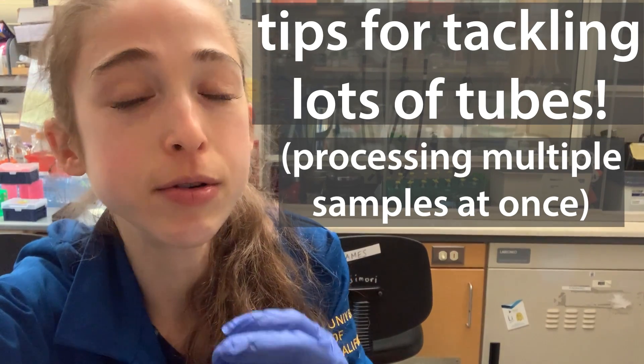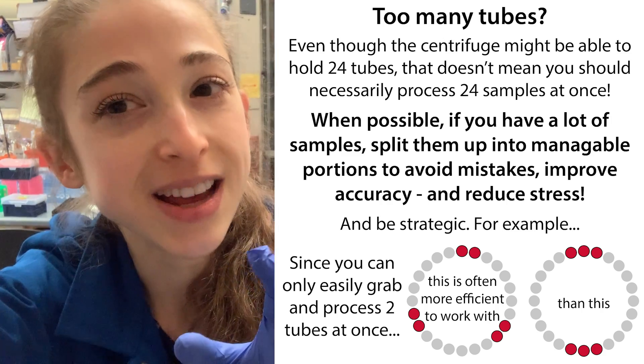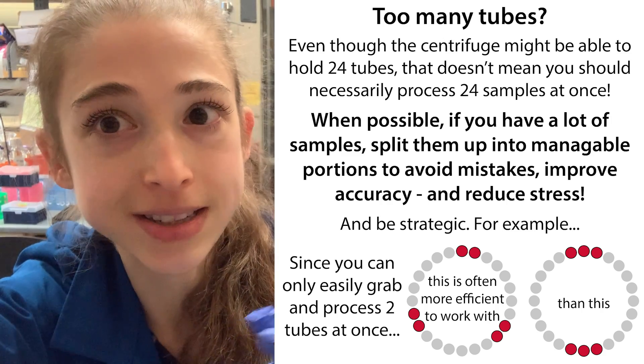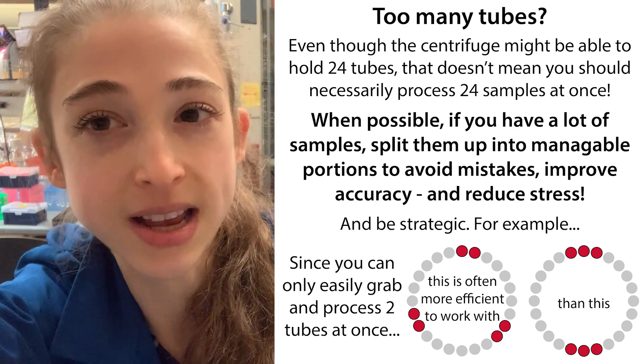If you have other samples you need to process, it can be really tempting to try to process them all at once. But it can actually be more efficient, more accurate, and less stressful if you split things up — maybe do two sets of six rather than one set of twelve.